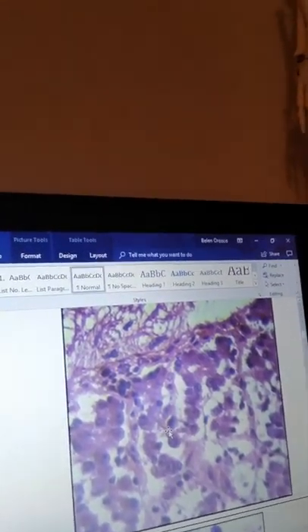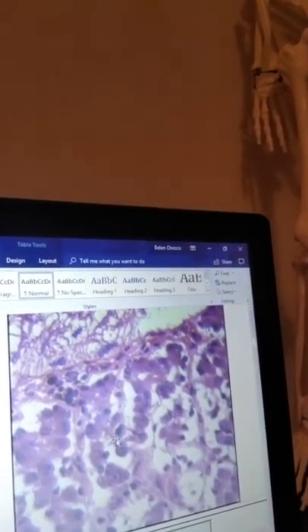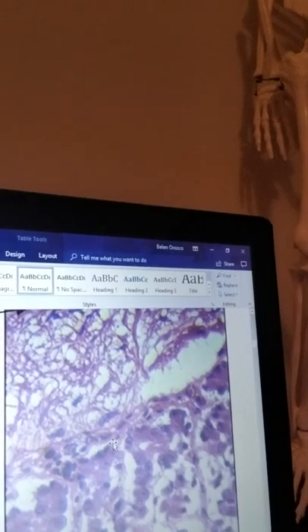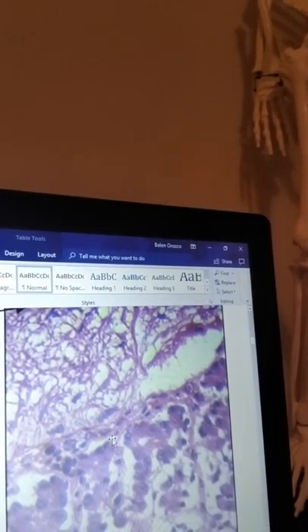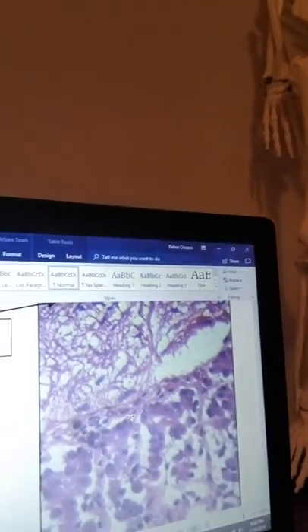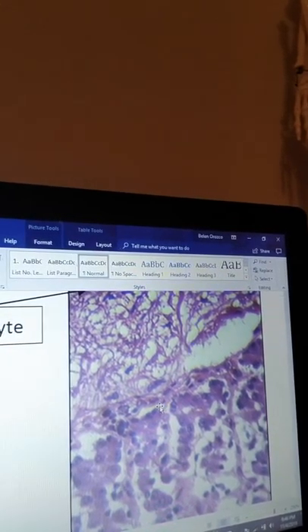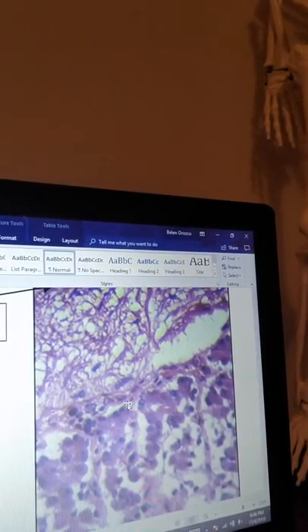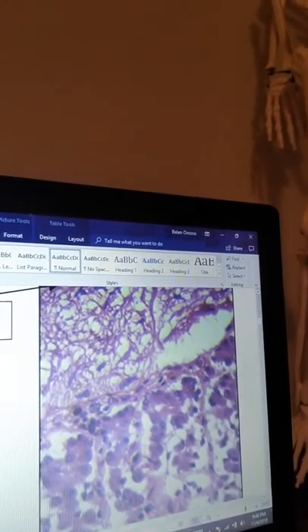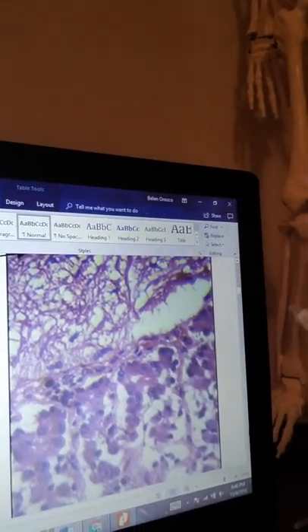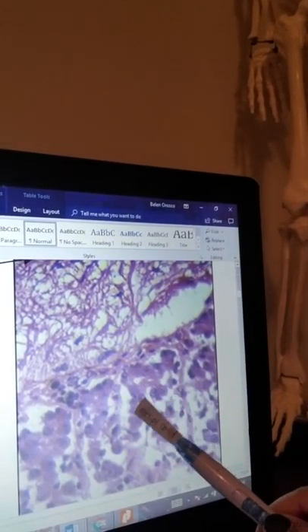For me the basophil was more like a reddish tint to it while the acidophil was more blue violet. So I found the acidophil right over here, right there.